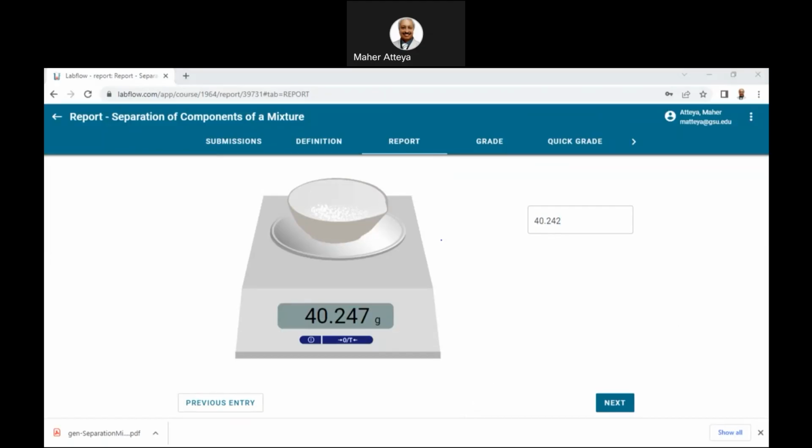So let me take this one here. Okay, so copy. And now we'll do the same procedure.